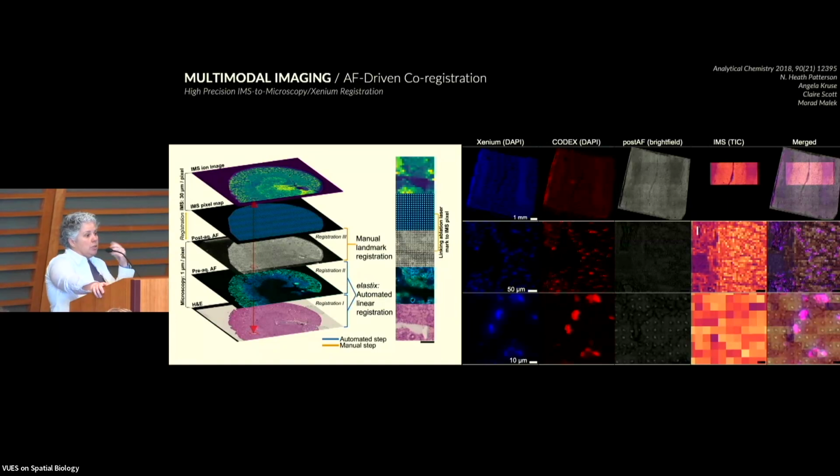So now, not only do we have the lipid profiles, but we can layer over that the cellular profiles that are being generated by CODEX, and then the transcriptional information being generated by Xenium. And now we have true crosstalk across our modalities. We can look at cell types as well as cell states and how all of these things are changing in tandem and try to answer some deeper biological questions.